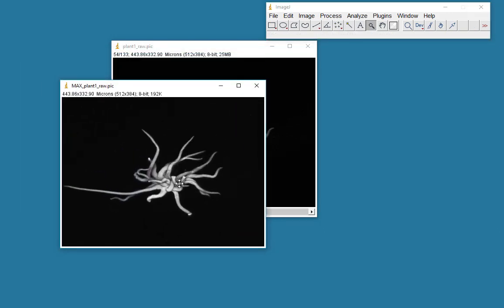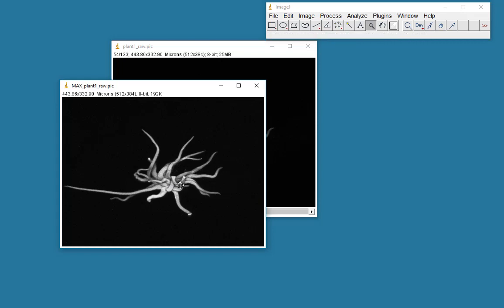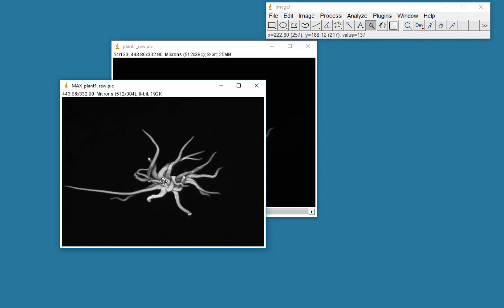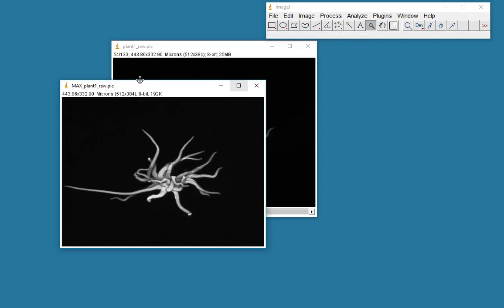Looks very 3D. And if I move my mouse around the data and you look at the numbers that are up here, you'll see that probably the maximum value that I will get would be probably 255, but probably just slightly less than that. But it's an 8-bit image. Let's just check that. Well, it tells us here it's an 8-bit image.